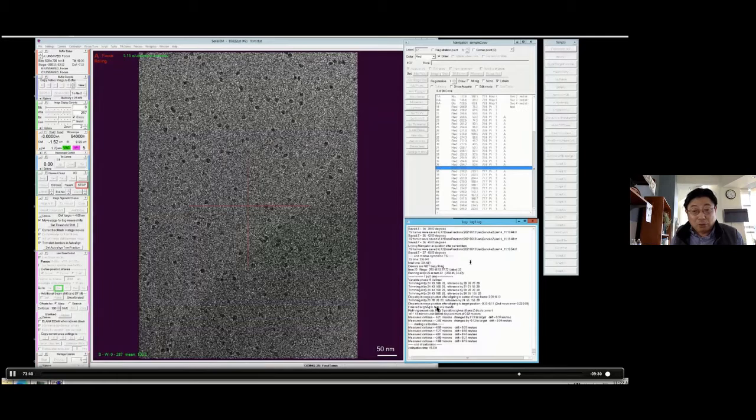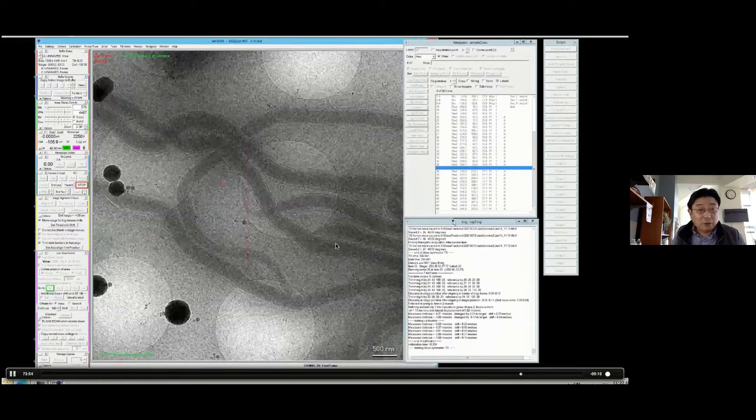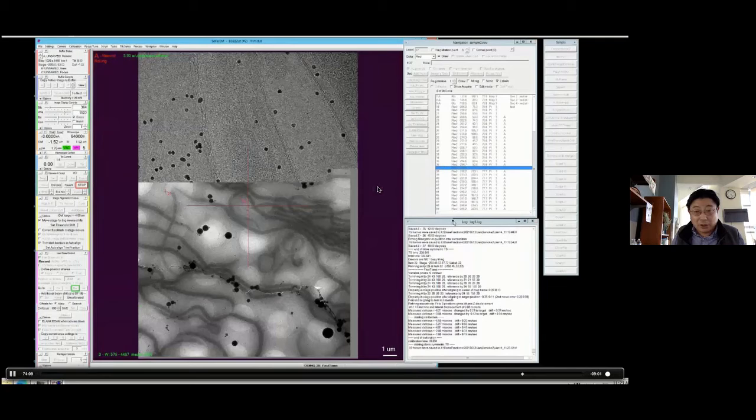But if you do more autofocus, the whole data acquisition step just slows down. By doing this so-called pre-calibration, you basically use the curve to help you collect data and adjust focus. That's actually one trick for this script to be faster. It doesn't always work, but anyway, that's the current status. And so now we're able to continue collecting data.